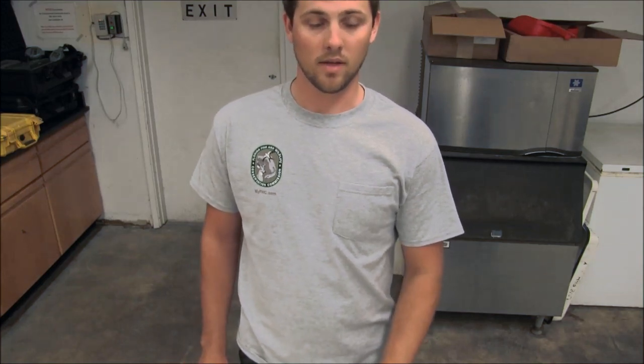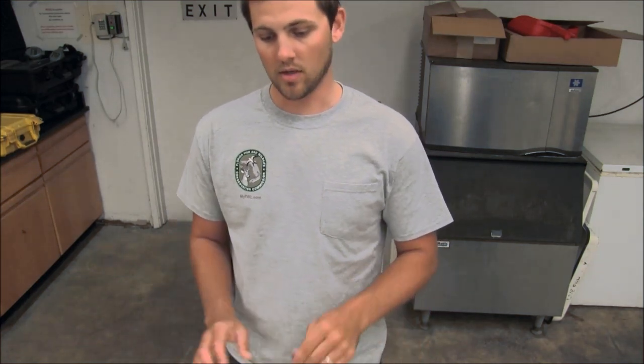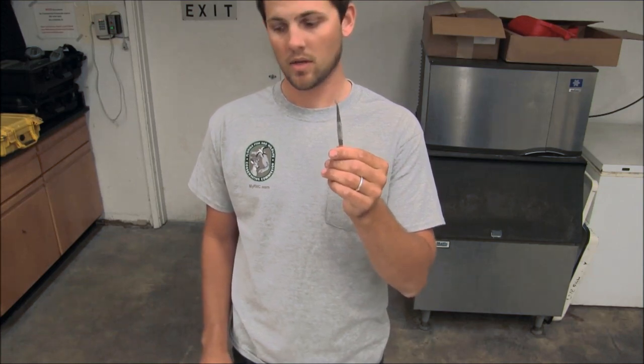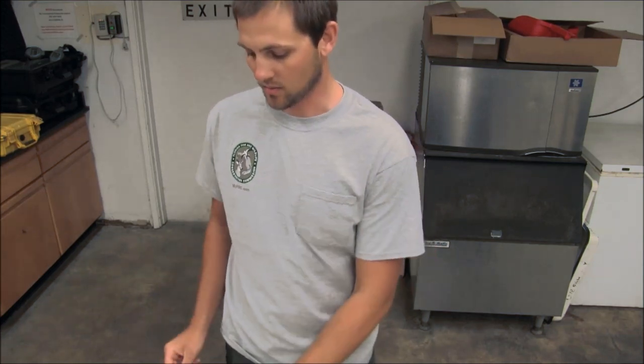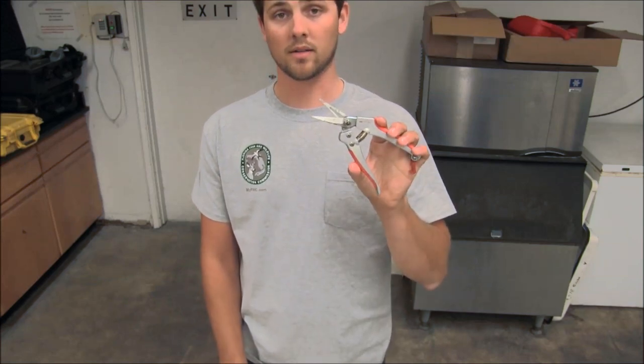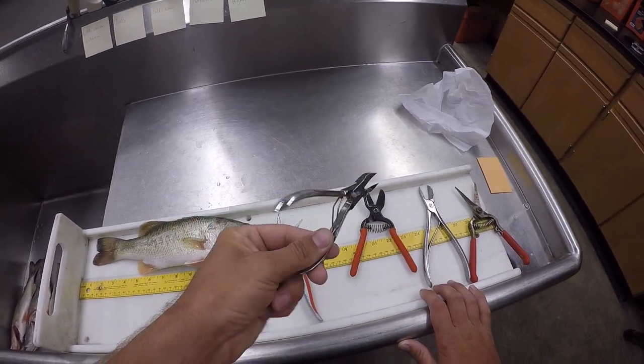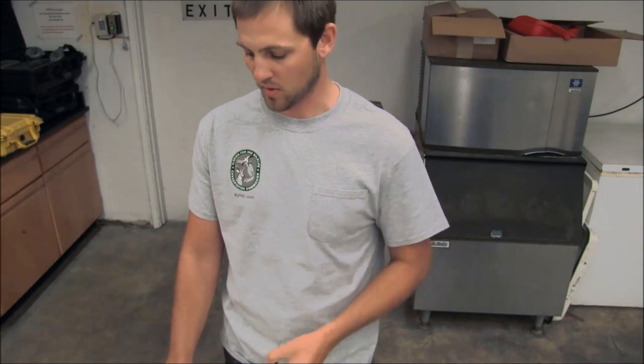Today we're going to be extracting sagittal otoliths from largemouth bass. Before you get started you're going to need a couple tools. First, you'll need a pair of tweezers. You'll also need some cutters to actually get to the otolith. They come in all kinds of sizes and shapes and a lot of times you'll just pair it up with what size or species of fish you're dealing with, in addition to personal preference.